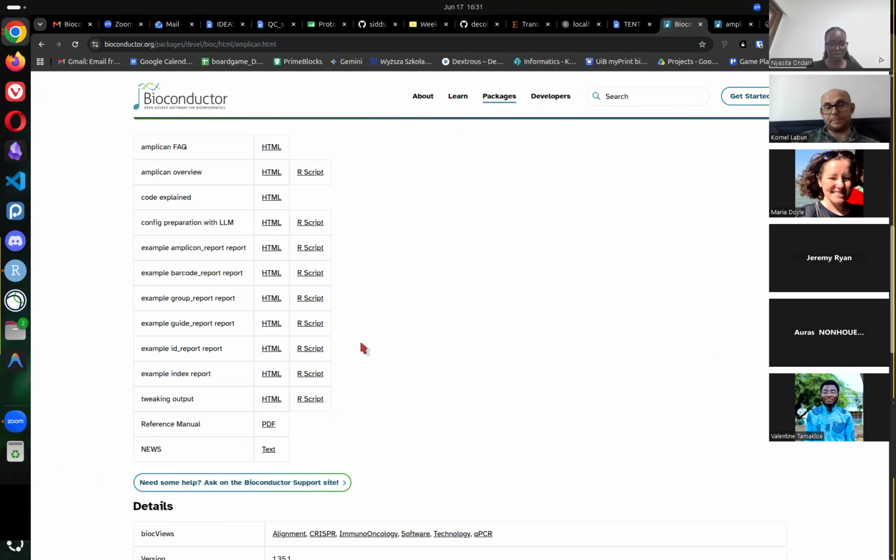And I do have one last question because we're already past 5:30. If you have two separate guides that are really far from one another, so you have like a 400 base pair amplicon, and then you have your short reads, which are around 150 base pairs. When you're creating this config file, and you have two or more guides for the same amplicon, how do you specify that?